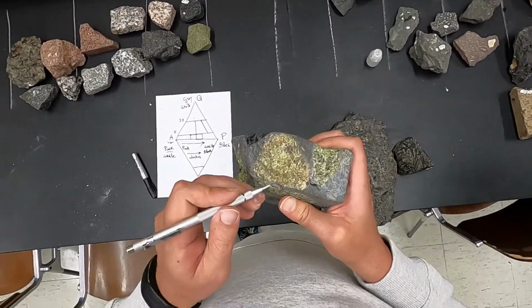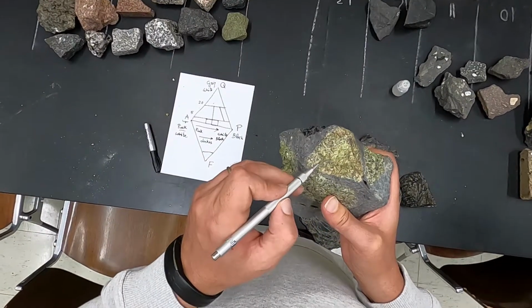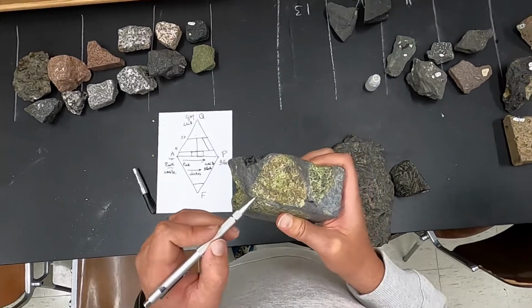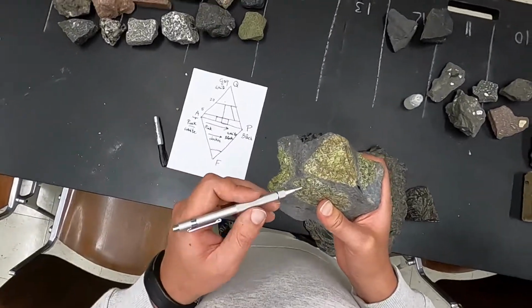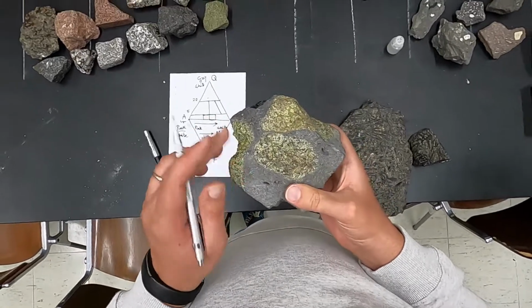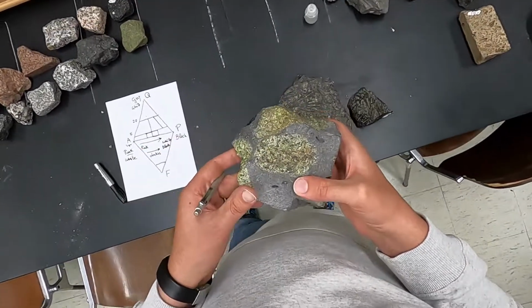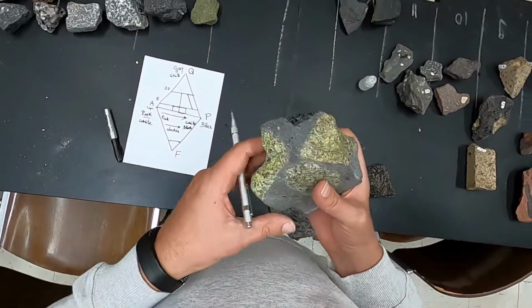And then you have also other olivine that is more yellowish in color because of the alteration. So some of the olivine usually alter into iddingsite. So in some of the peridotites you can find iddingsite, which usually is more brownish in color because of the alteration. So I believe that could be an explanation for the appearance.